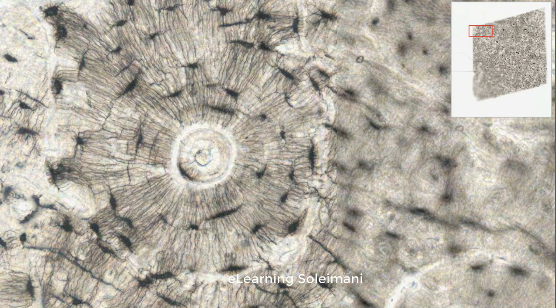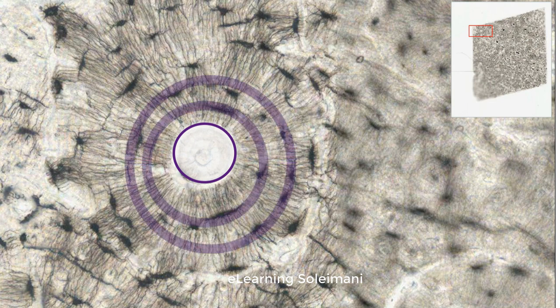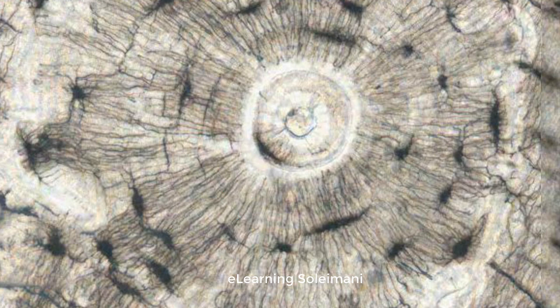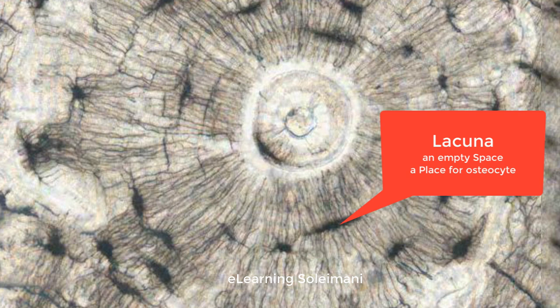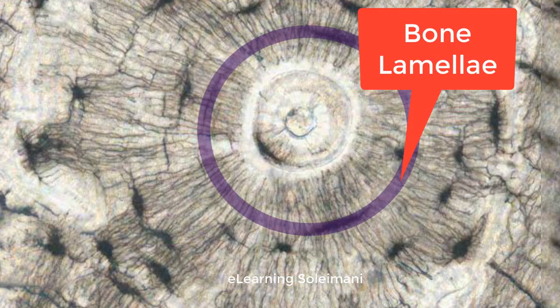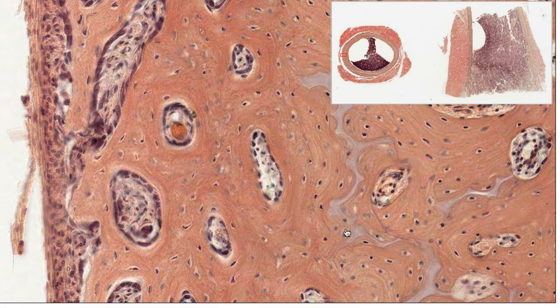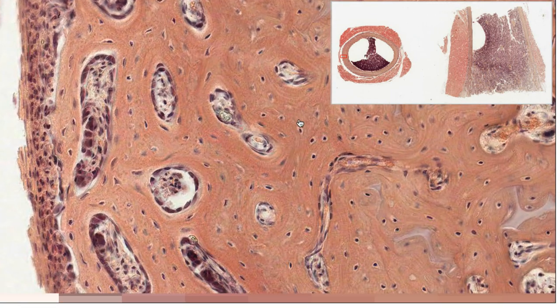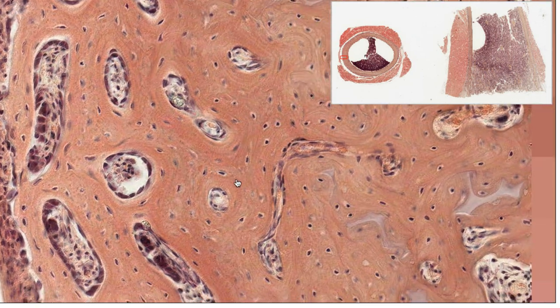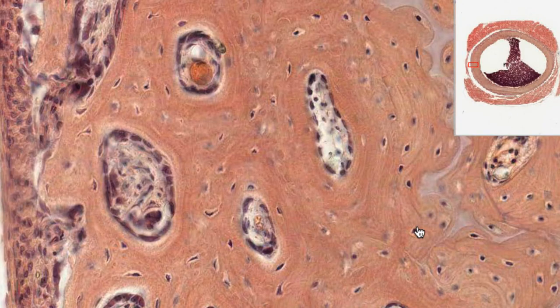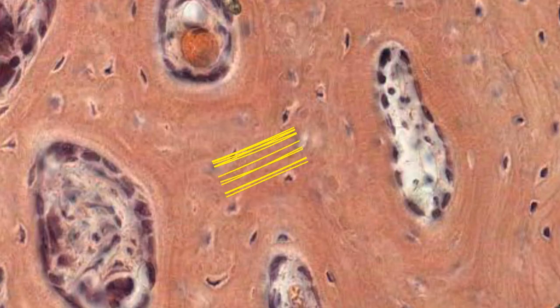Here you can see a Haversian system including the Haversian canal, circles of osteocytes, and their canaliculi, which are small channels containing extracellular fluid. The Haversian systems have varying sizes of canals, and there is another canal named Volkmann's canal that interconnects them. Between the Haversian systems there are interstitial lamellae.